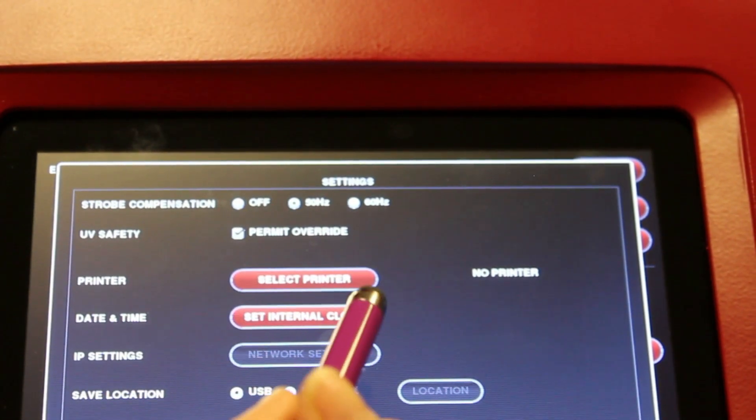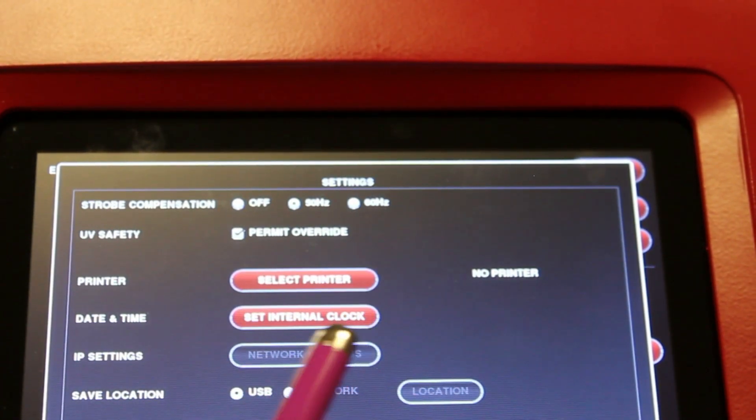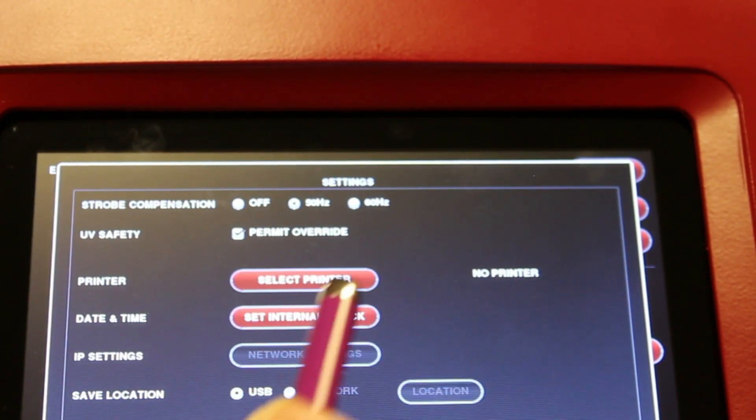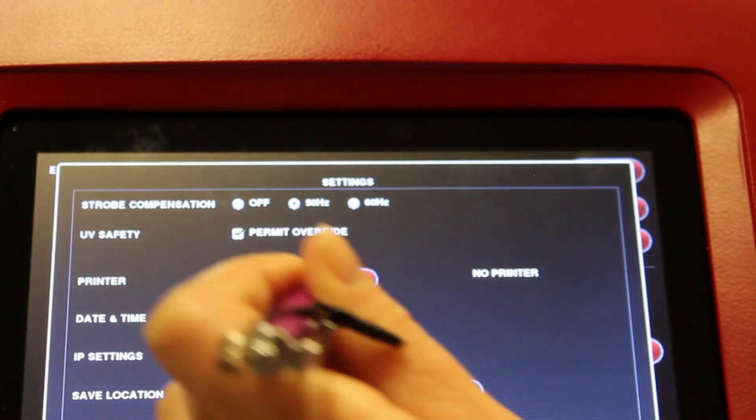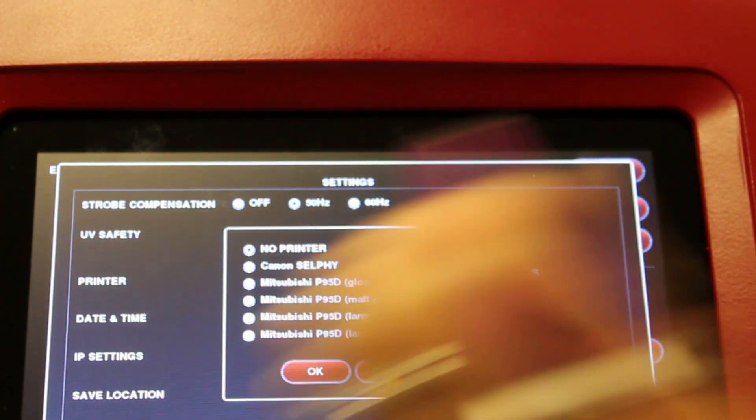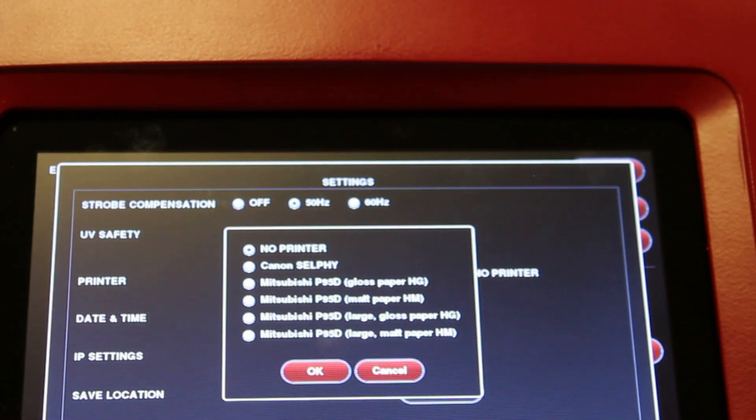You can purchase a thermal printer to go with your Neugenius system. If you have purchased a printer, you can select it from the list here. Press the select printer button and choose your printer from the list.